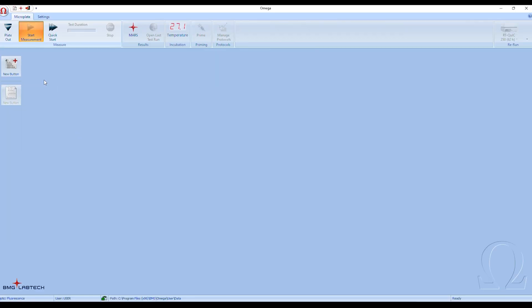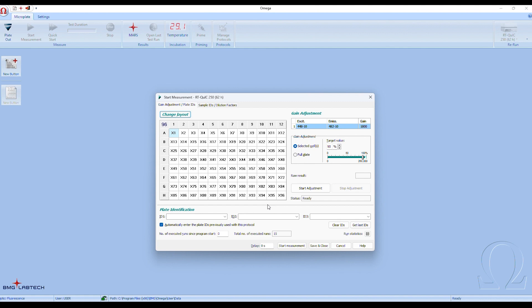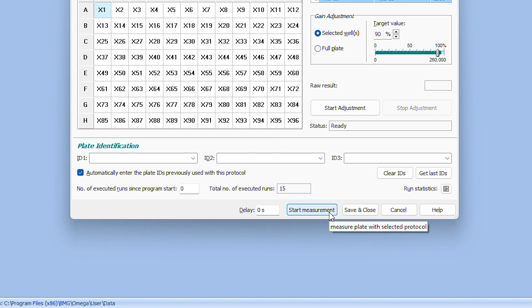Choose the appropriate RT-QUIC protocol for the desired temperature and cycles, which will depend on sample type and desired application. Running for too long or at too high of a temperature may cause an increased rate of false positives.